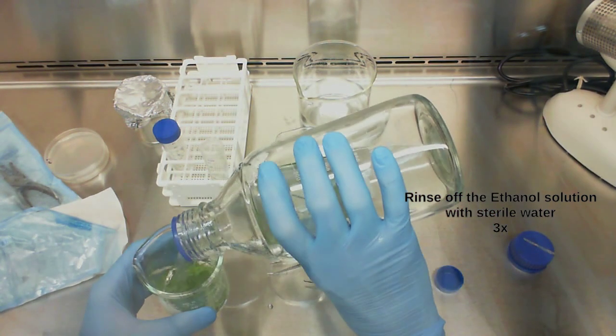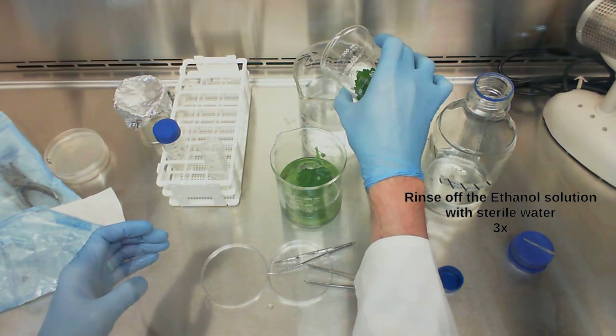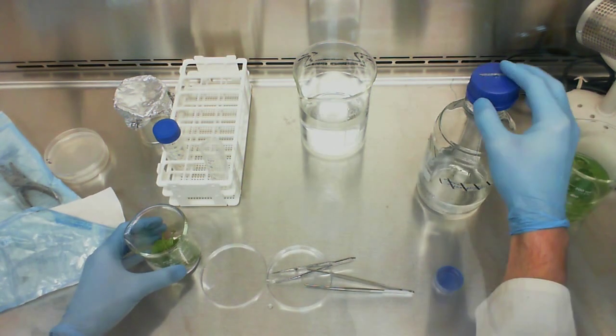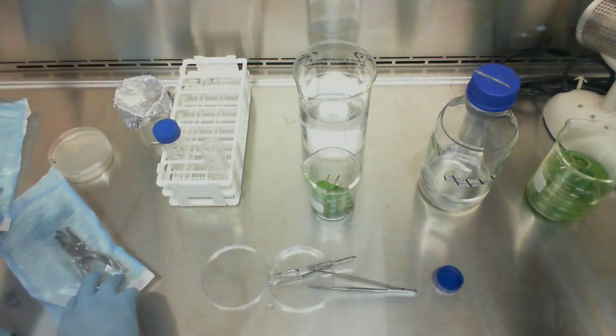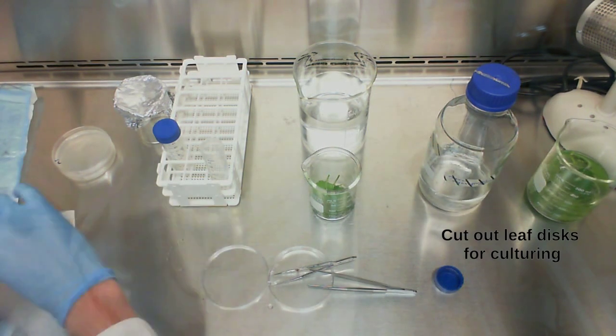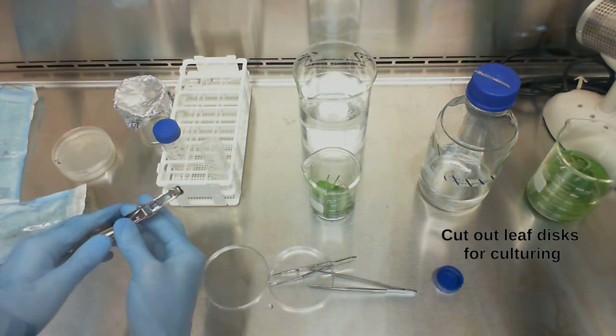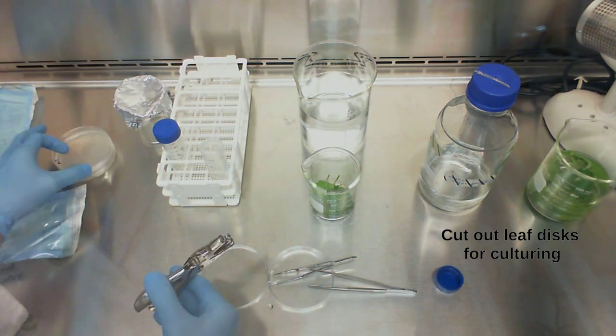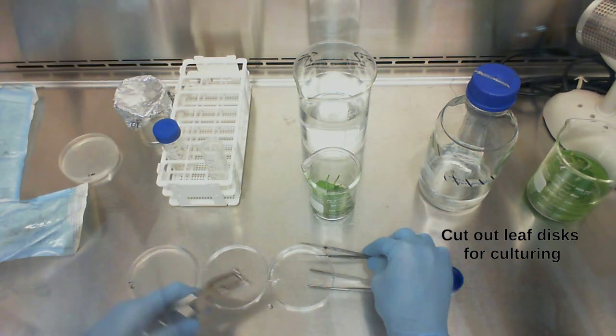Last wash. Now I have my forceps ready to go. I just need to take out my hole punch. This thing is going to allow me to make nice circular holes in my leaf, and I'll be able to generate a whole bunch of discs very quickly and easily. So here's my plate. Just free up a little bit of space here.